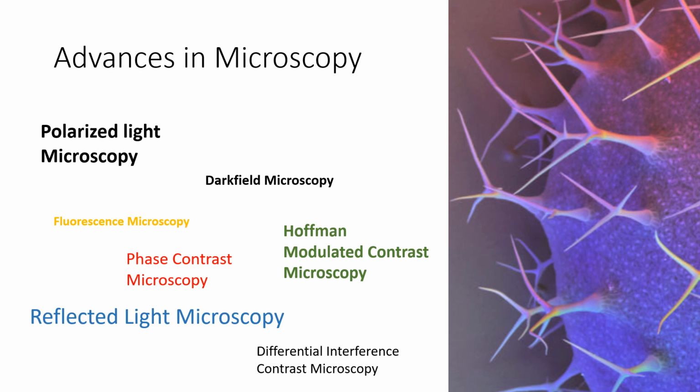So this was all about microscopy, and I hope you have understood the fundamentals of image formation, how our image gets formed: the basic 11th, 12th grade ray paths, how the light travels, how it interacts, and how it forms an image eventually. This is a beautiful and basic principle that drives the field of microscopy, and it is very much relevant in all these sophisticated forms of microscopy also.